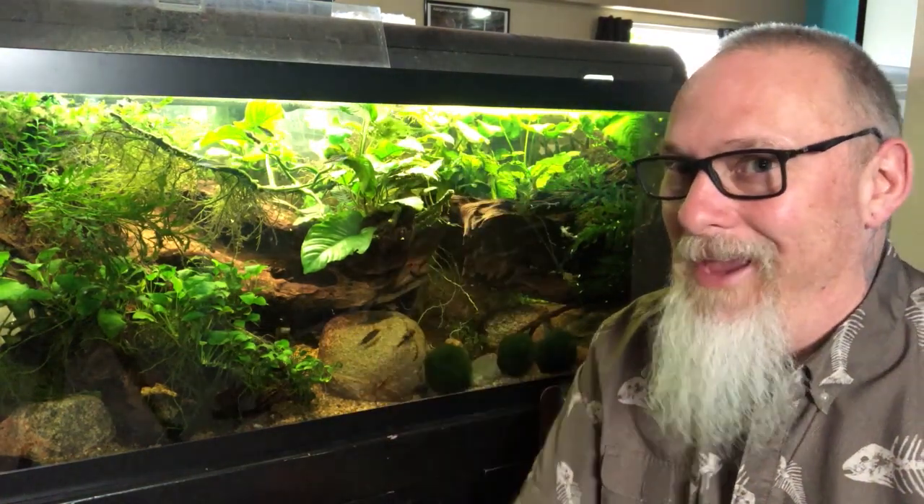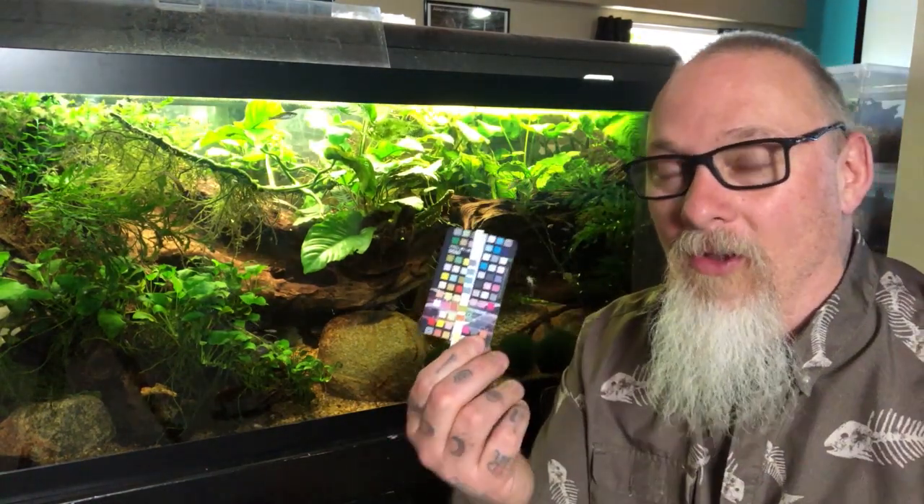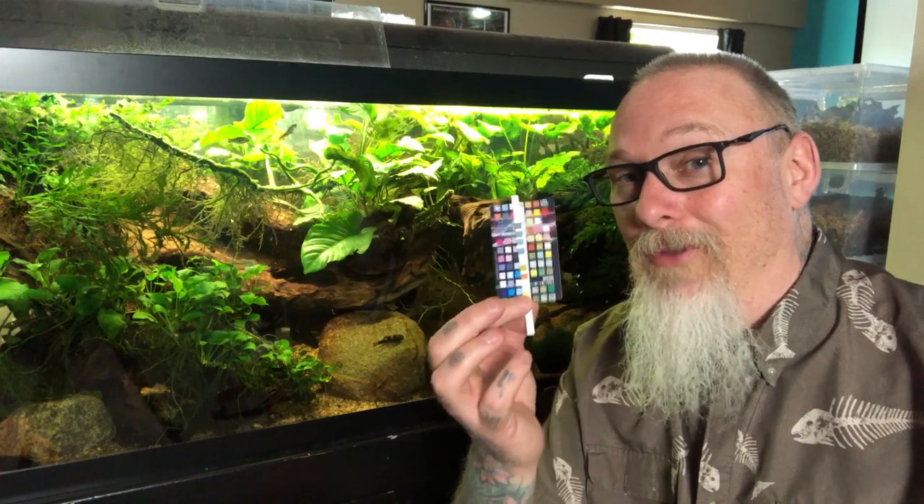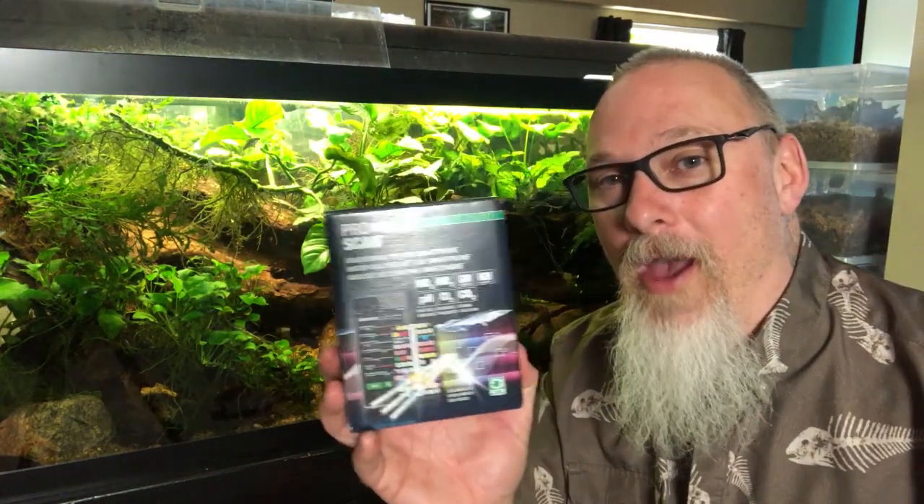So all in all, I think this is super cool. Overall, I'm very impressed. For the price of this thing — honestly it's under $40 — and the replacement strips are under $30. To get started for 40 bucks, it's what you're going to pay for a good quality test kit anyway. I know some people may not like the idea of paper strips, but this is coming from Germany and I think these guys have got it figured out. The way this thing works with the phone — the phones and the lighting and everything — they can pick up spectrums that we can't see with the naked eye. That's always been a problem with paper strips: they give you color charts and you're looking at them like, 'Where am I? I'm kind of between these three colors,' and that could be a very large degree of variance. So overall, I'm very, very impressed with this. If you guys want to get one yourself, it's called the JBL ProScan, under 40 bucks.